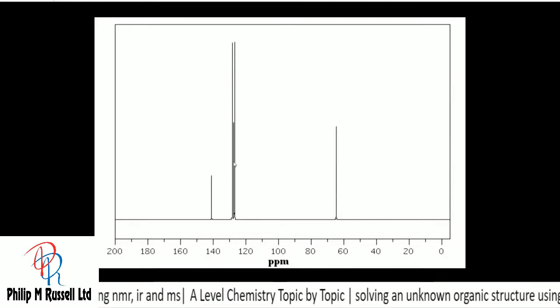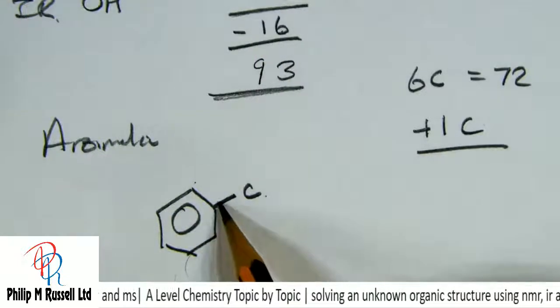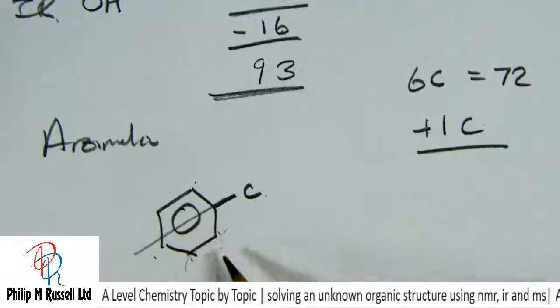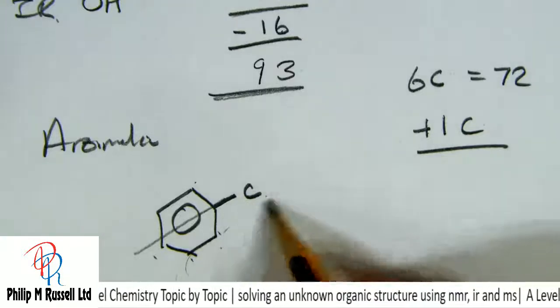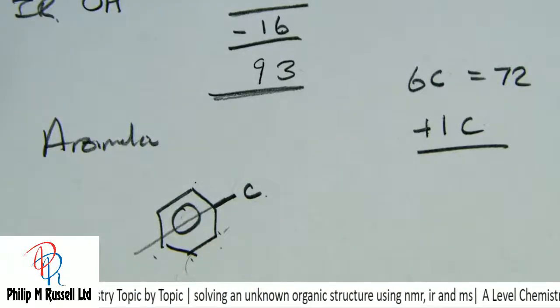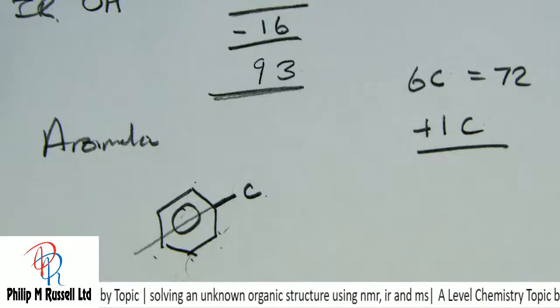We've got our basic symmetry here of 3 and 3, haven't we? Yeah. Then we've got 1 carbon all by itself. This carbon 13 is confirming what we knew before, but we're just checking, and we can see the position of that OH purely by where that symmetry is happening in the spectra. So that's no problem. That's good.